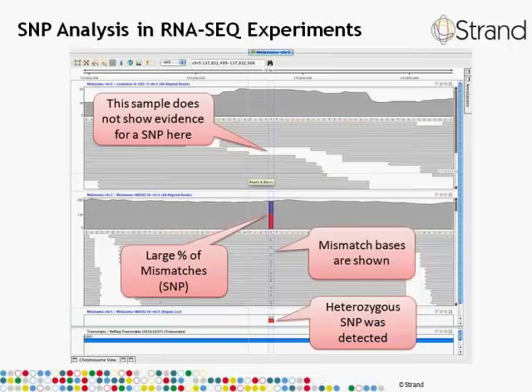The story of EML4-ALK fusion is even more interesting in the fact that recently there have been some patients who show resistance to targeted therapy. In fact, it was using Illumina deep sequencing of cDNA from patients' tumors that revealed that there could be 2 additional and independent mutations which result in structural changes in the protein that is transcribed, and it interferes with EML4-ALK's ability to bind the targeted drug.